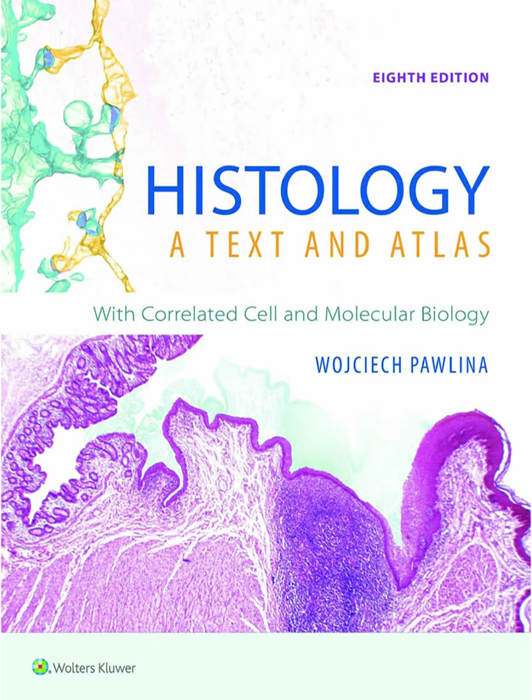Cells take these up and incorporate them into newly synthesized large molecules like proteins or DNA. Then, you coat the tissue section with a photographic emulsion, like old school film. You leave it in the dark for a while. Wherever the radioactivity is concentrated in the tissue, it exposes the silver grains in the emulsion directly above it. So you develop it like a photo and see black dots where the new molecules were made. Precisely. It shows you exactly where those new molecules were synthesized or accumulated. It was crucial for figuring out many metabolic pathways.